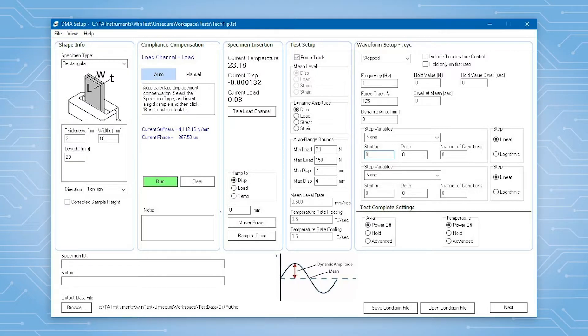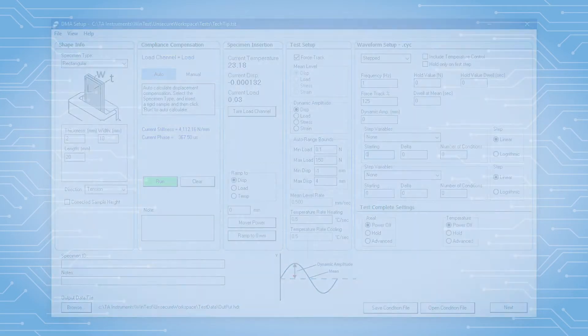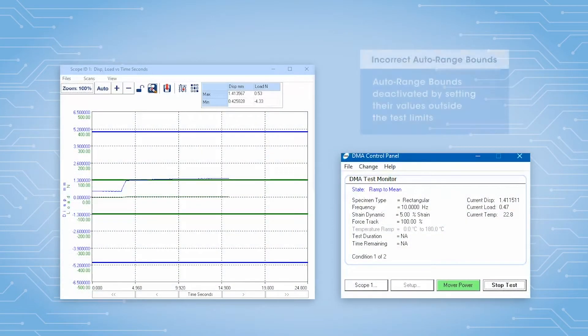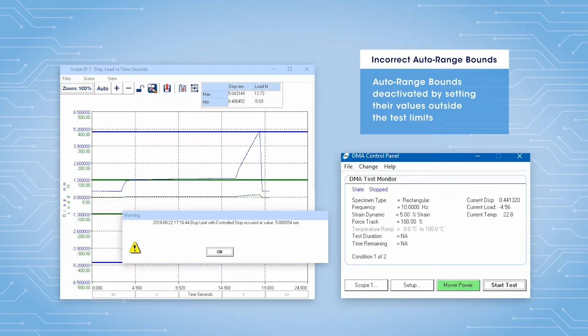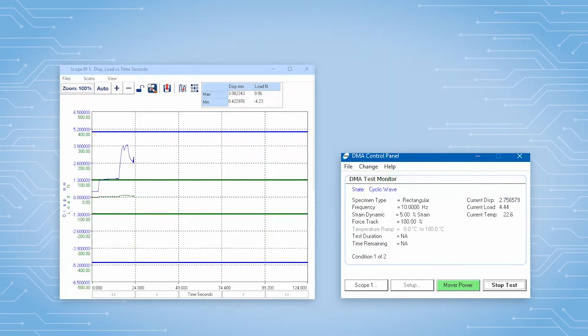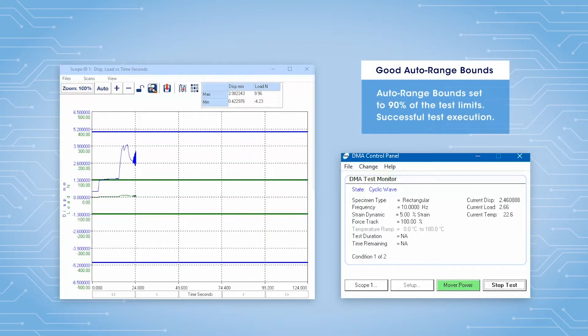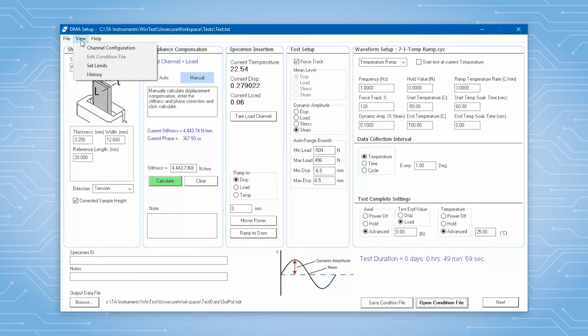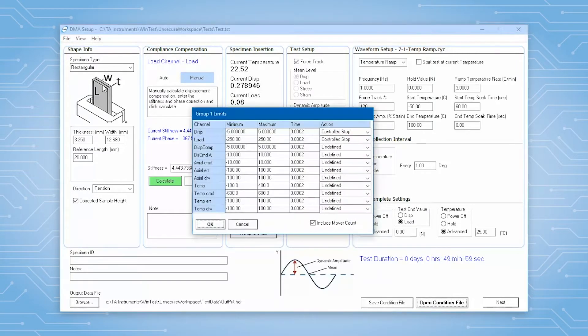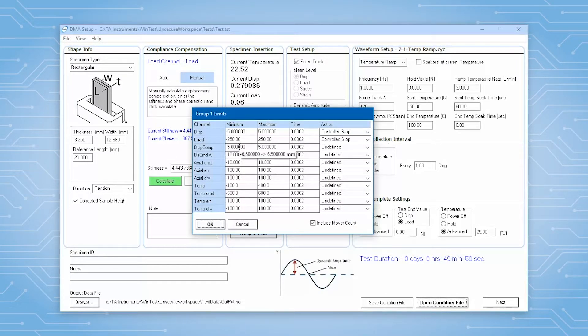Also, in the test setup panel are the settings for the auto range bounds. The auto range feature for the DMA adaptive controller will adjust the waveform if needed. For instance, it will adjust the waveform to keep the test running within the capacity of your sensors. Auto range bounds are automatically populated based on your geometry and system limits.